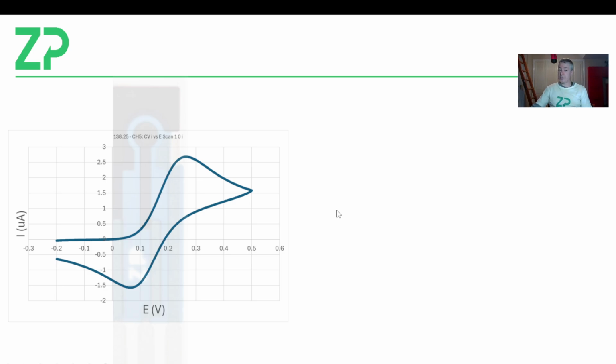But in this particular case, this person's not interested in our quality of manufacturing. They're interested in how to analyze this section of the cyclovoltammogram. I often call it the kinetic region, where the concentration and the rate at which material has to diffuse or be mass transported to the electrode is not the limiting factor. It's simply the potential, the signal is increasing proportional to potential.